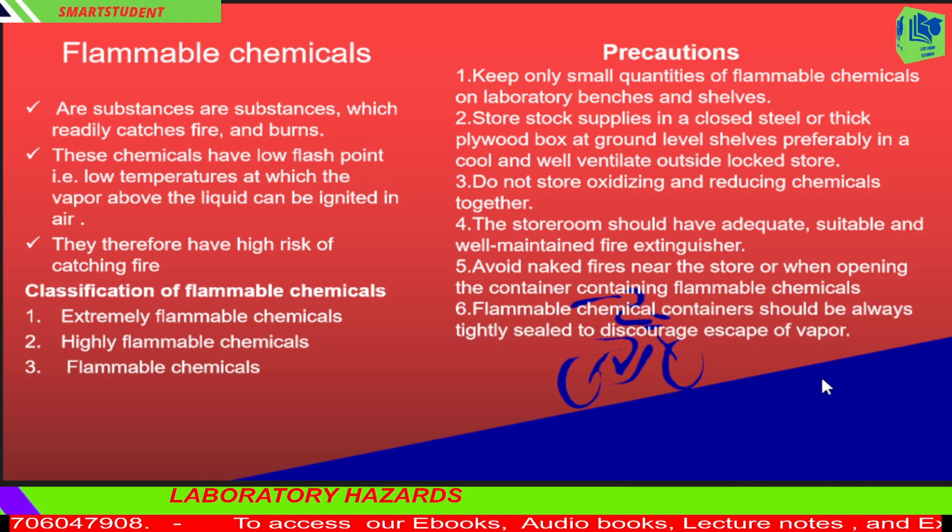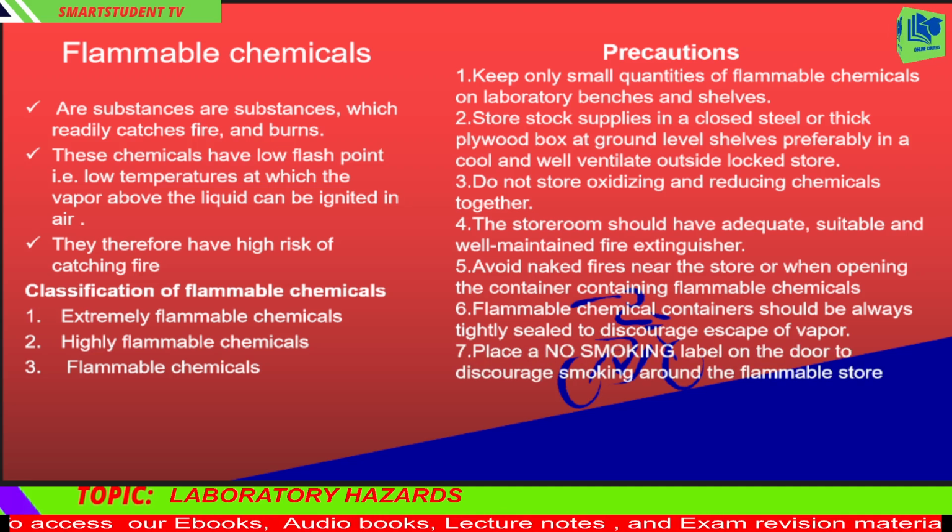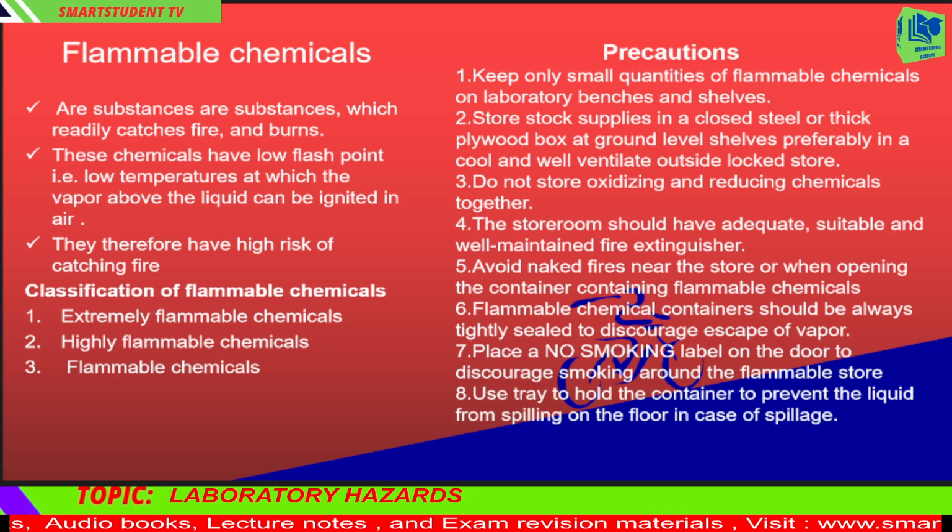6. Flammable chemical containers should always be tightly sealed to discourage escape of vapor. 7. Place a "No smoking" label on the door to discourage smoking around the flammable store. 8. Use a tray to hold the container to prevent the liquid from spilling on the floor in case of spillage. 9. Use a water bath to heat flammable chemicals.